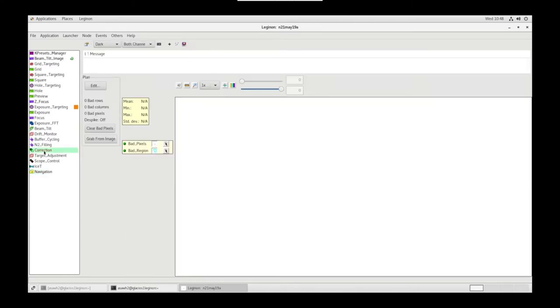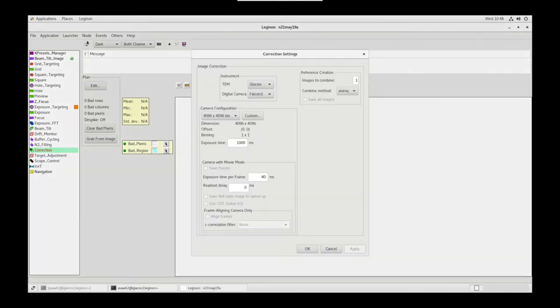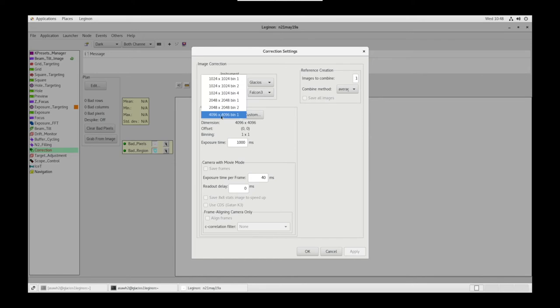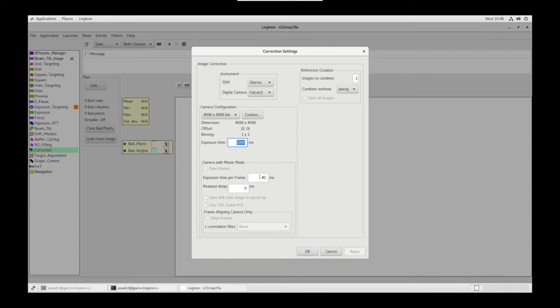Now let's go to the Correction node. In Settings, we want our TEM to be Glacios, our digital camera to be the Falcon 3. Our dimensions will be 4K by 4K, bin by 1. Our exposure time will be 1,000 milliseconds. Our exposure time per frame will be 40 milliseconds. Click OK.